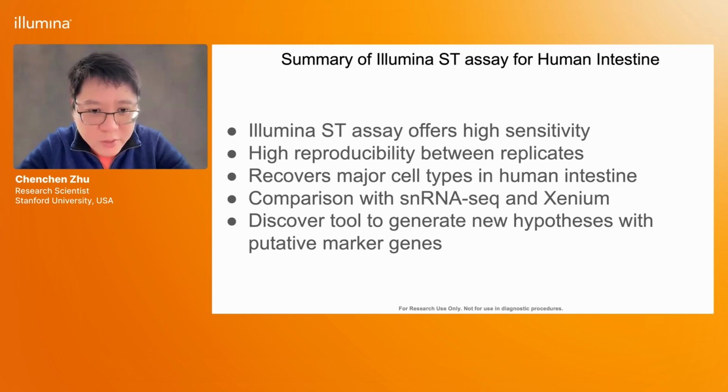But I think the real value is to use this as a discovery tool to generate new hypotheses. I think it's going to be important so that people can find new markers and then put them into a targeted panel if they want to follow up.